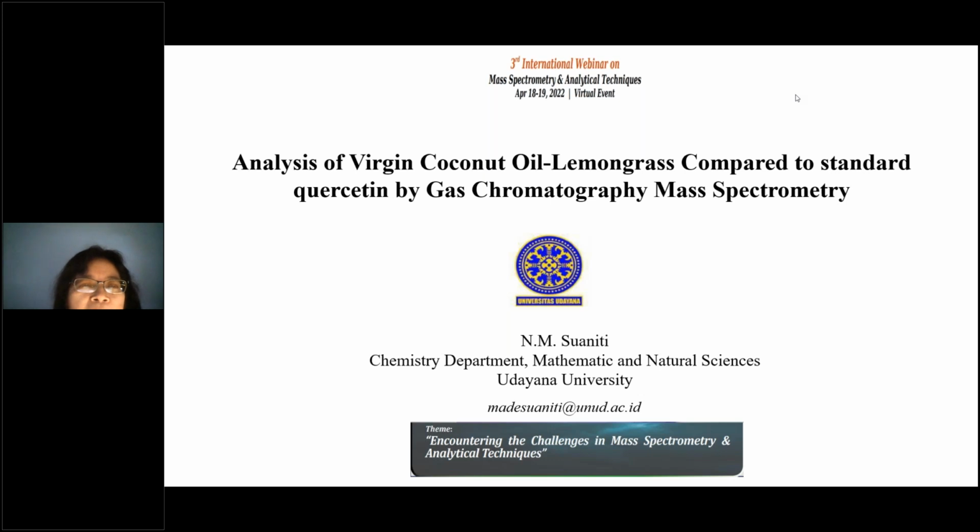The title is Analysis of Virgin Coconut Oil Lemongrass Compared to Standard Quercetin by Gas Chromatography Mass Spectrometry.